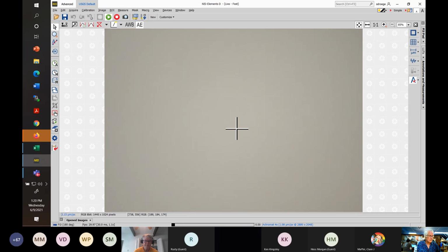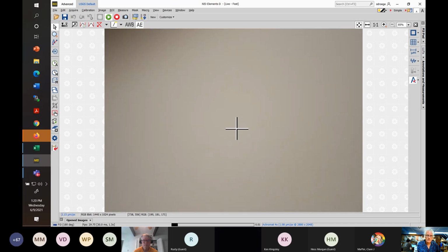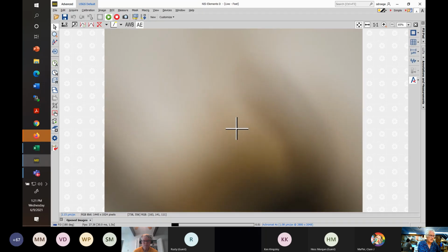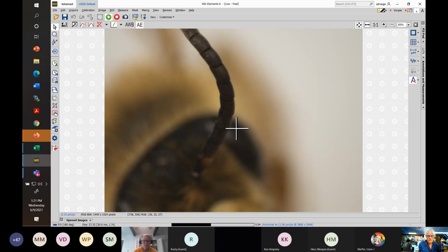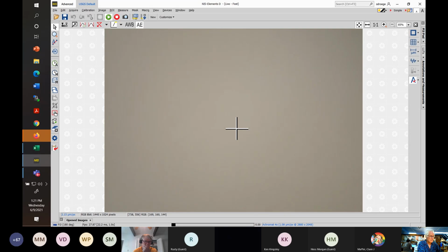Let's look at this from underneath, and then we'll look at a couple other specimens to get a sense of what S8 might look like under different circumstances. Actually, now that we've got the head, we'll return to S8s. Maybe it's good to jump around. I'm trying to bring in some light here.